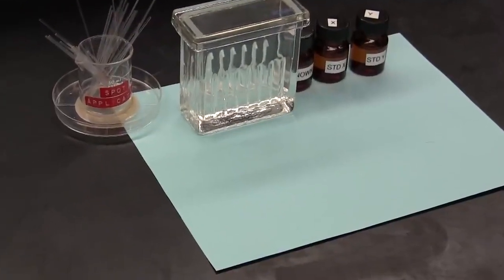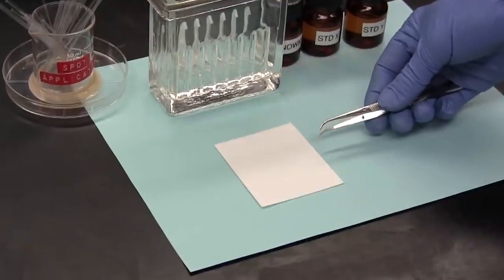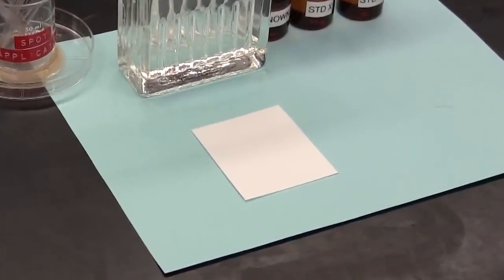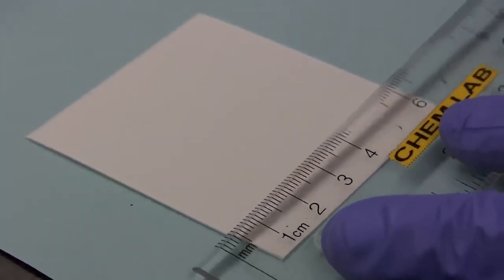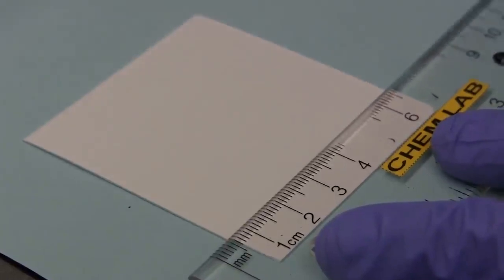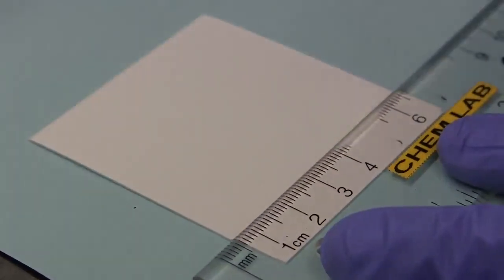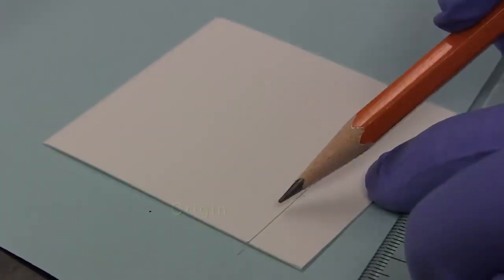First of all, we need to prepare the TLC plate. Make sure that you handle it only by its edges or use tweezers since we don't want to contaminate the silica gel surface. A ruler is used to draw a line using a pencil about 1 centimeter from the bottom edge of the plate. Draw only a very light line and try not to score the surface of the silica. This line is called the origin.